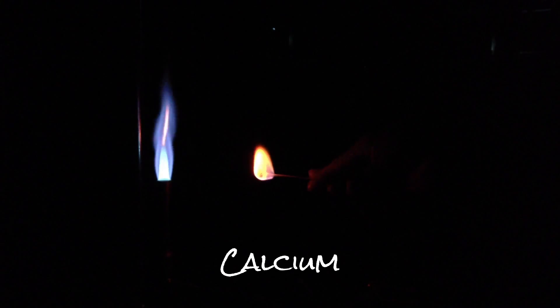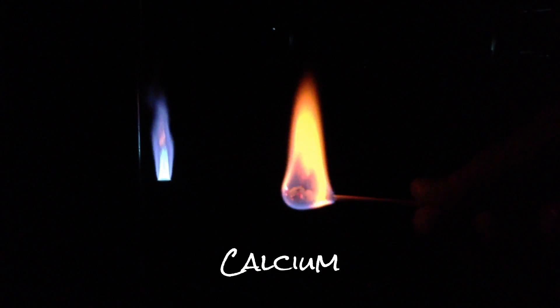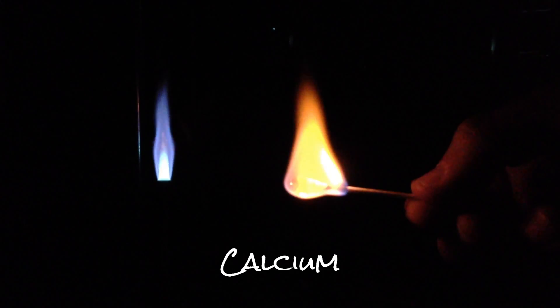Now we're going to move on to the next element, which is calcium. Same thing — wetting the swab and dipping it into the ions. And there is my calcium — it's got a different color to it. To properly discern the color, we would actually take a diffracting lens or some way to look at the individual wavelengths of the photons of light being emitted. Don't confuse that with the little yellow burning from the edge of the cotton swab.